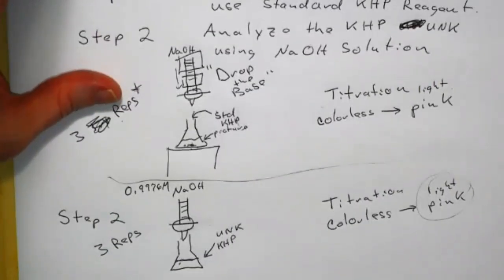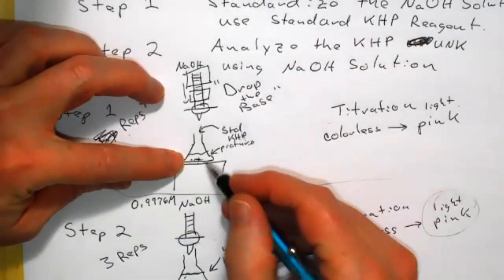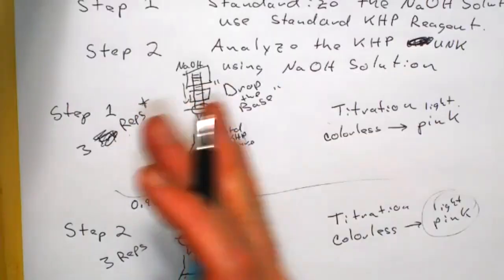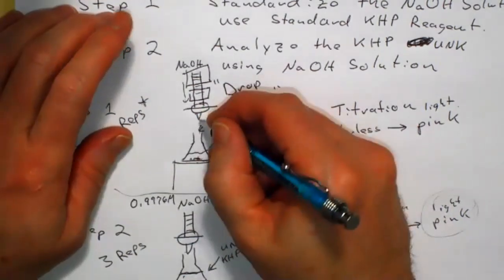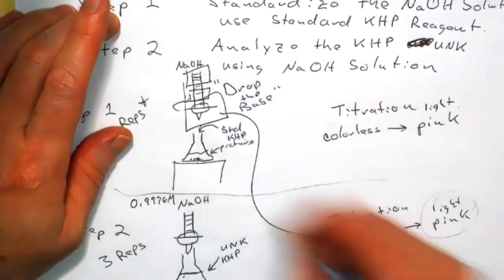Okay. And in fact, let's go back to the picture. In fact, we're going to try, you think, oh, 1 drop, that you've seen that in like Gen Chem or somewhere else, where 1 drop is the difference between clear and colored in your titration. That's right. So pat yourself on the back and then do it better. So to do better, I'm going to blow this up. I got to get a fresh sheet of paper.